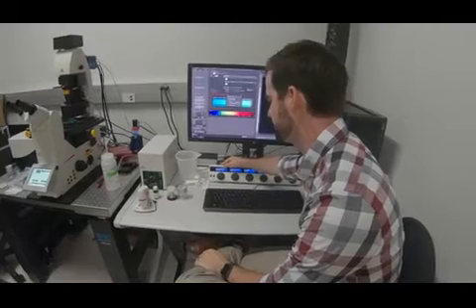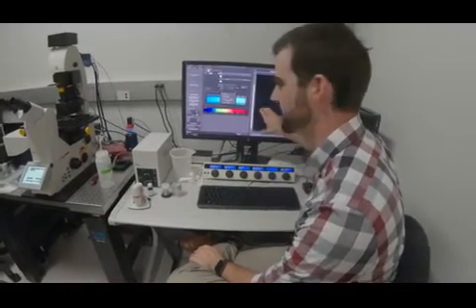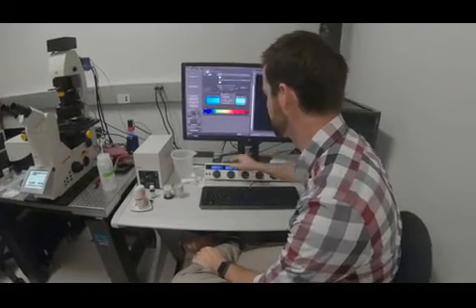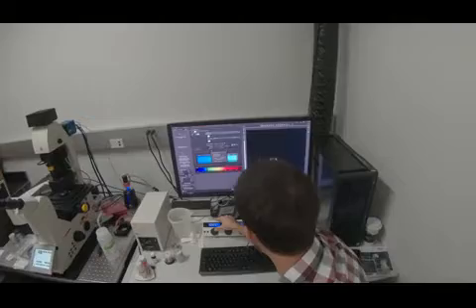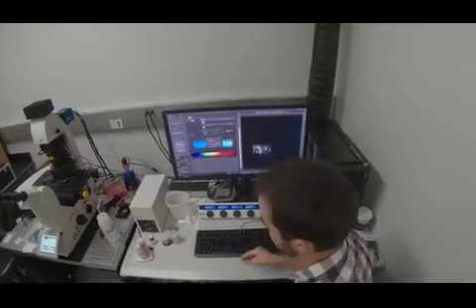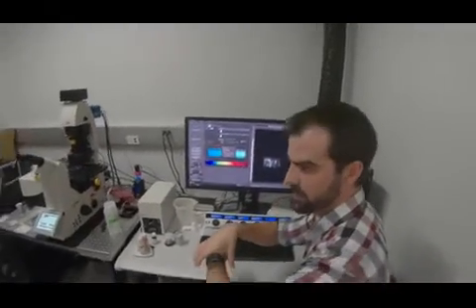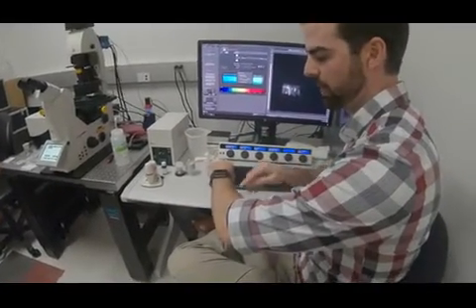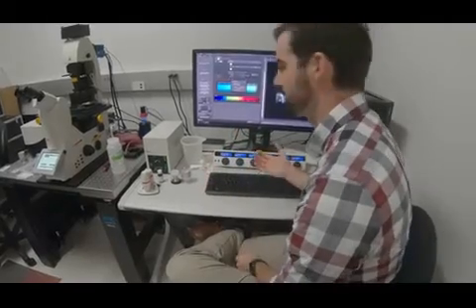So light sheet position Z, position Y, so where exactly it's forming the light sheet. The width, other positions, so we can change this scene. So now what we're doing is a sample detection depth is fixed. We're looking at a fixed part of the sample, let's say looking at the top. But then where we form that sheet of light, in terms of fine tuning, is up to us.